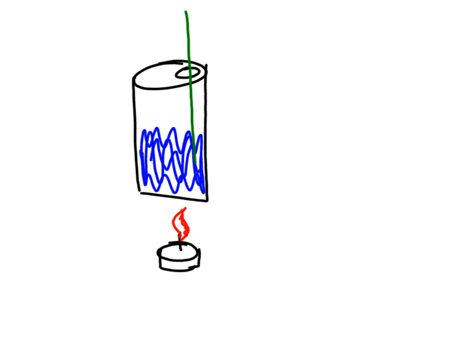So what should be occurring is as this candle is burning, now keep in mind when a candle burns, we're not burning the wick, you're burning the actual wax that the candle's made out of. So when we burn that paraffin, which is C20H42, in the presence of oxygen, it's going to be giving off heat. Like when you light a candle, it's giving off heat. Well, that heat is then going to be transferred into the water, and then when that water heats up, we'll be able to use the change in temperature of water to determine how much heat was given off by that candle.